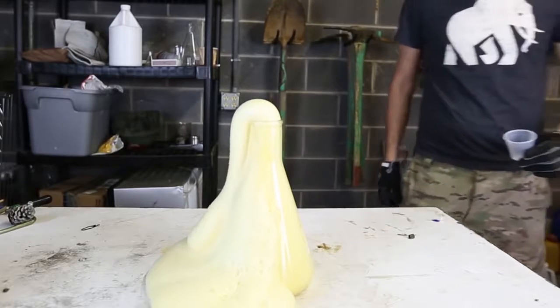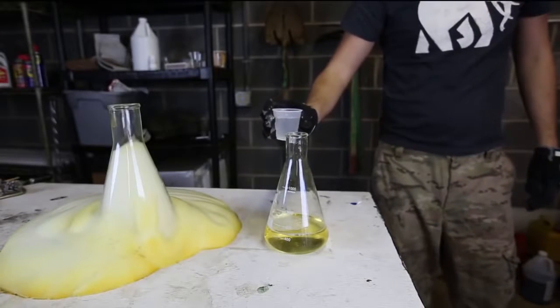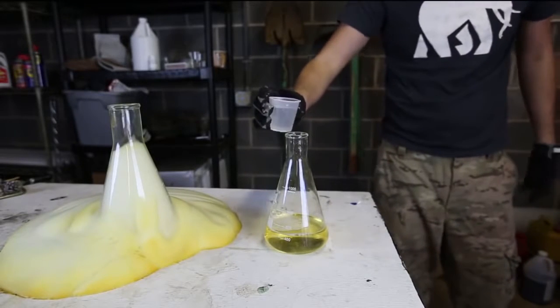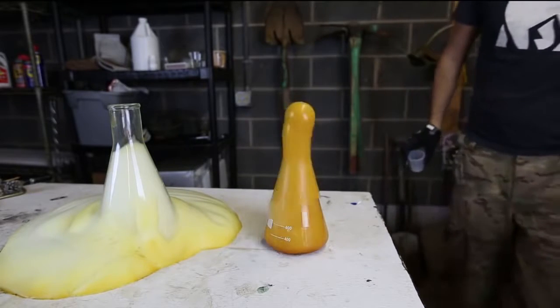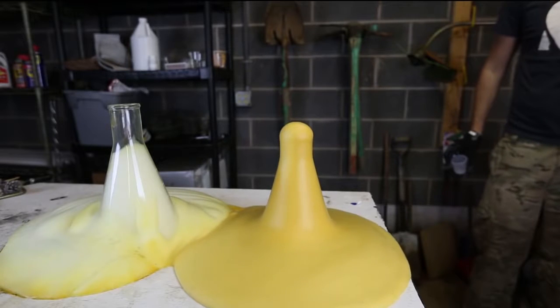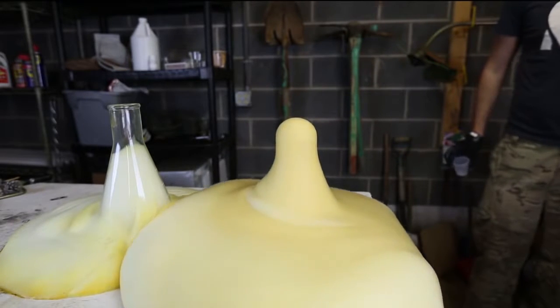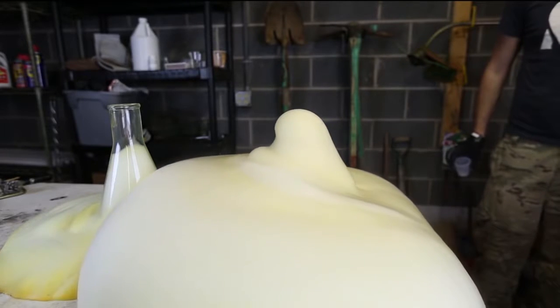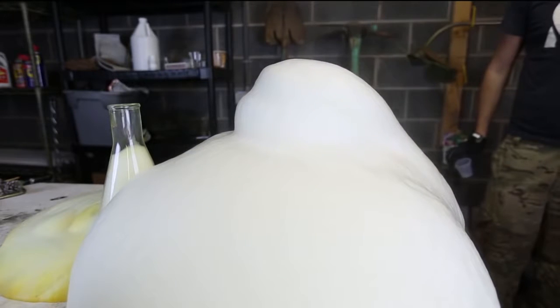That's a lot of foam. What do you guys think? We gotta try this again in a little smaller beaker. Got potassium iodide solution and hydrogen peroxide solution. Put it together. Look, it turns black. Boom. Whoa! This is insane. Look at this giant volcano foam. Whoa! Holy crap! No way! No way! What did I just do?